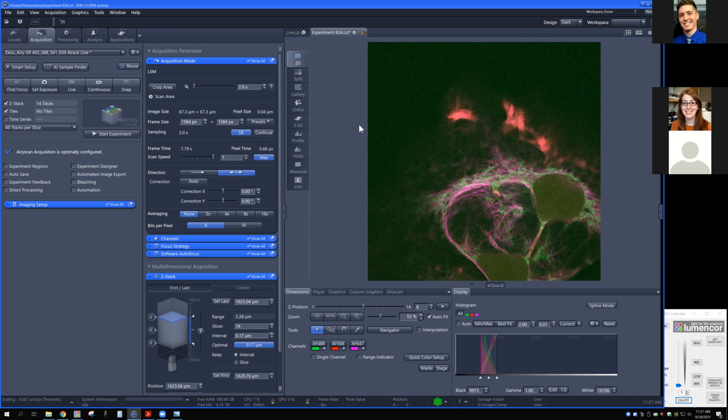So are you talking about regular confocal mode or with Airyscan? With Airyscan specifically. Yeah, I mean, for regular confocal and spectral, I'd always recommend it. Having the extra bit depth, working with 65,000 levels of gray rather than more than 256 levels, generally gives you a really nice intensity resolution when it comes to analysis. For Airyscan, I guess what I would mention is you can, and certainly now with the 980 where the file sizes are smaller, it's probably worth it.